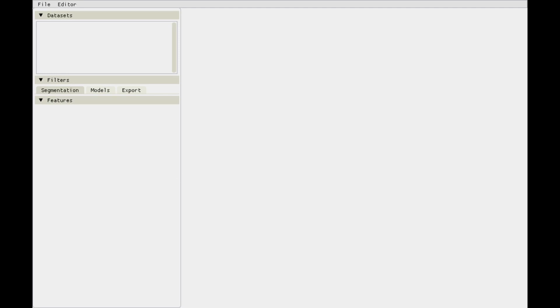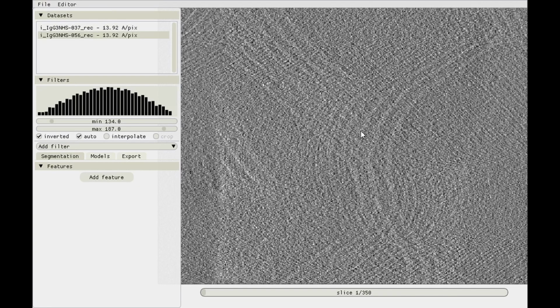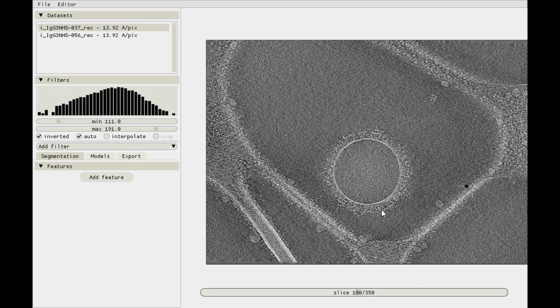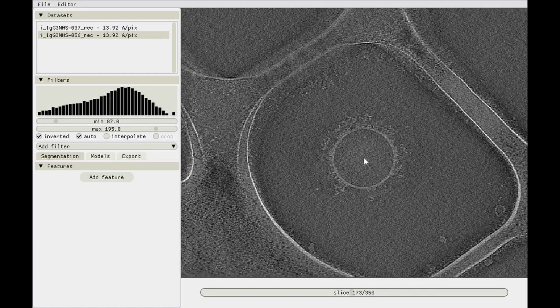processed volumes. So first of all, I'll drag two files onto the viewer to import them, or you could have gone to File and then Import Dataset. And these are cryo-electron tomograms acquired with an Arctica microscope on samples that contain liposomes decorated with antibodies and C1 on lacy carbon film. So you can see membrane, protein, and lacy carbon.